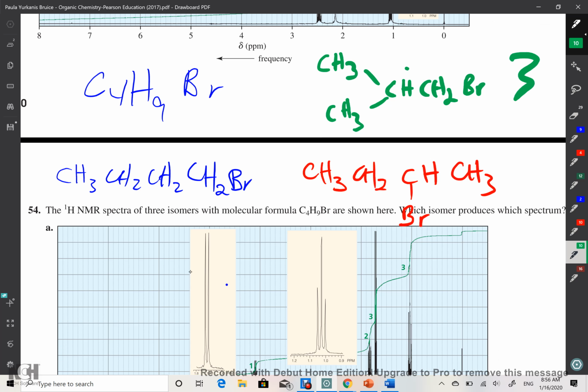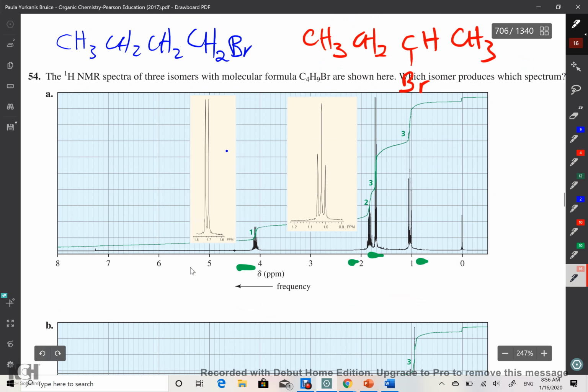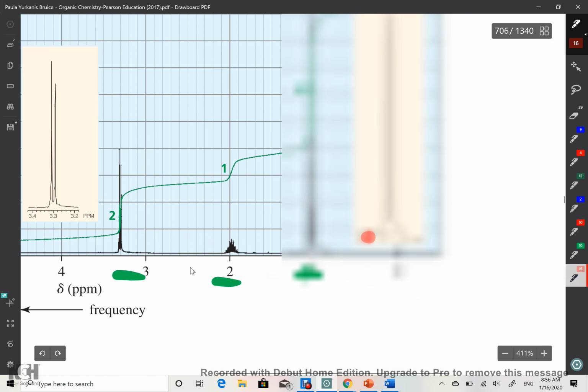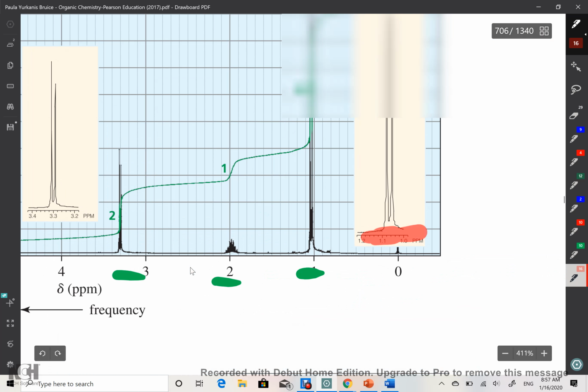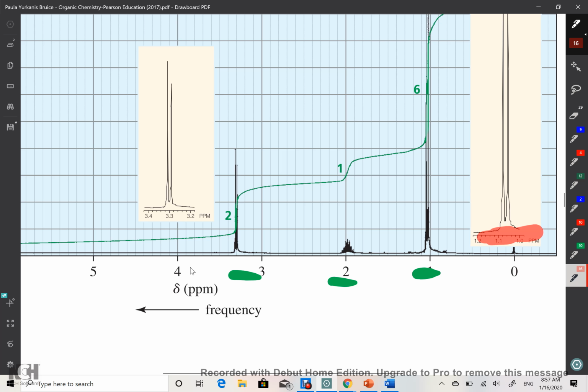And then you can still determine the multiplicity. If you look at the multiplicity, this proton here should give you a doublet. And so if I go down there, if I look at the signal, you see we have a doublet there. And we also have a multiplet over here. You can guess the one that will give you the multiplet.